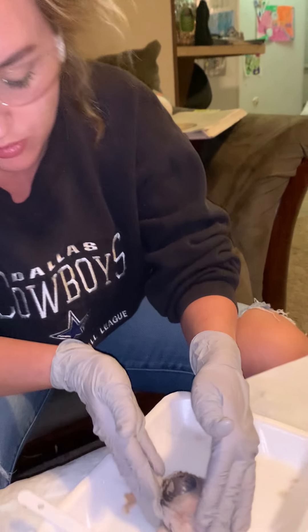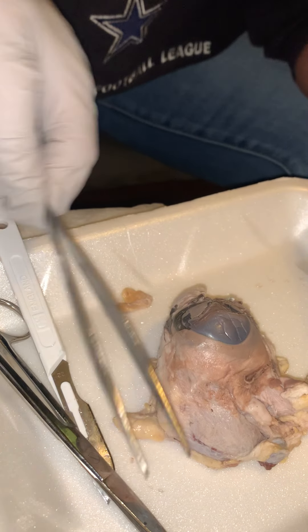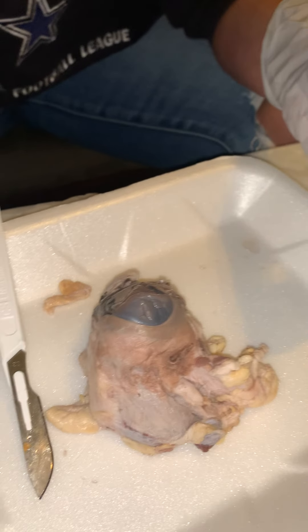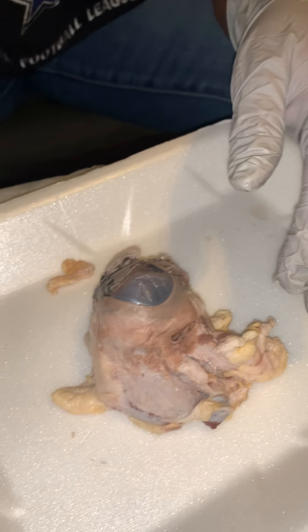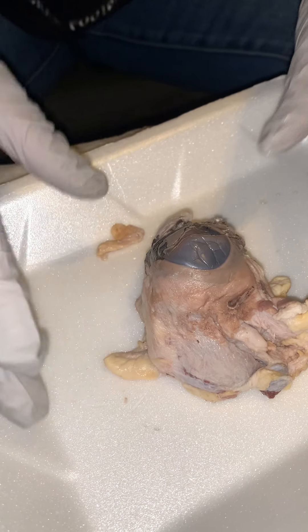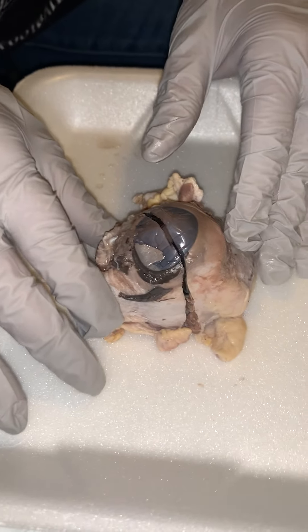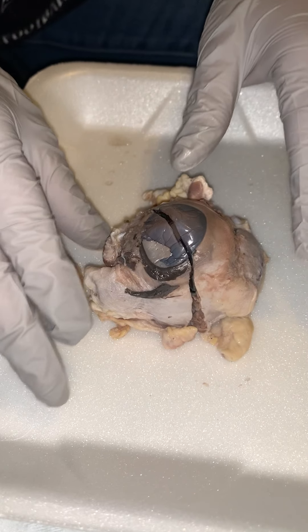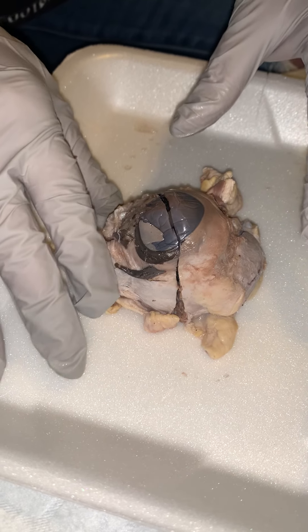Today here is our sheep eyeball. We went ahead and rinsed it. We've got our gloves on and all of our proper tools ready to go. This tissue is exceptionally tough, so I went ahead and cut it before we started this video. We were struggling to get into it, so we wanted to make sure we had that all done and ready to go.